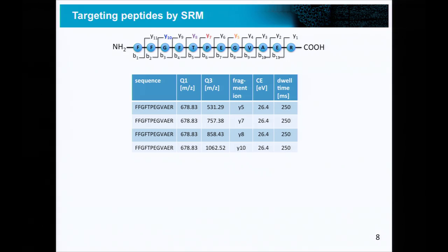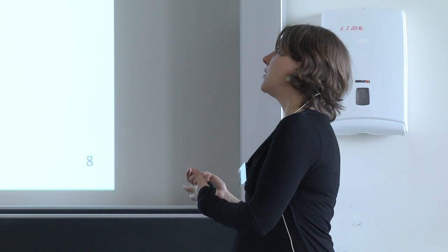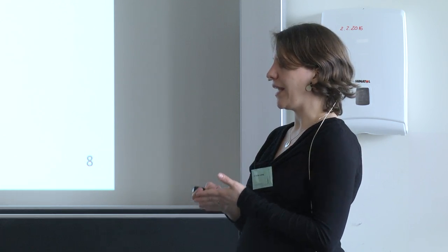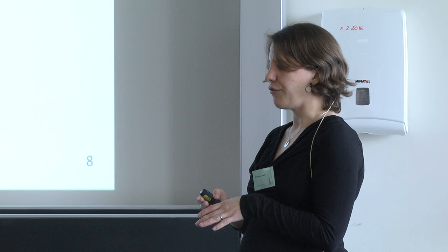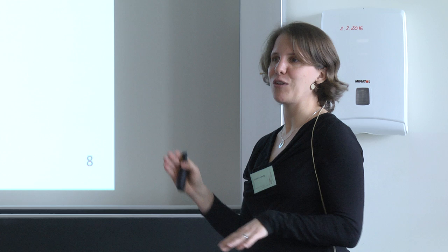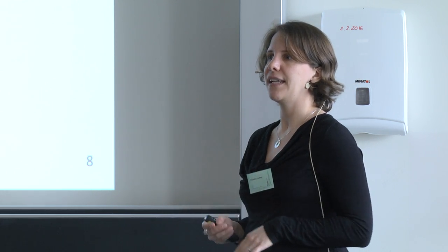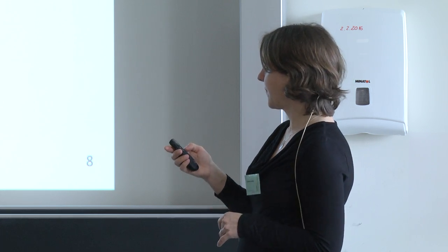And the last column is the dwell time. Sometimes dwell time is also called accumulation time or acquisition time. What all these expressions mean is the time that you want to give the instrument to accumulate signal for a specific transition over time. And usually the longer you give the instrument time to accumulate signal, the better the instrument can differentiate a true signal from the noise. So ideally, you want long dwell times so that you get very clean measurements, your noise can be very low, and your true signal really increases over this noise.